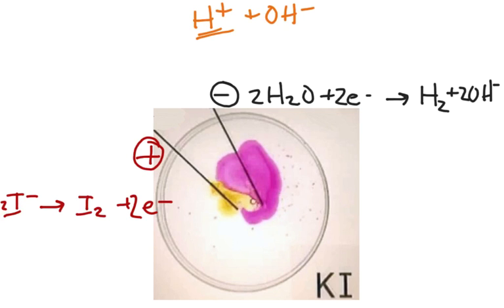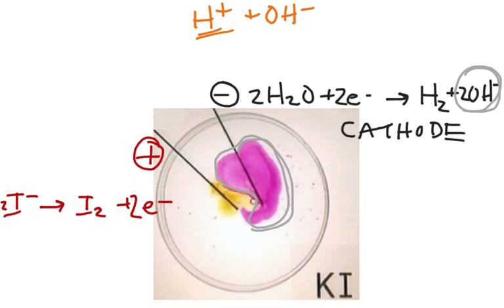So at this negative electrode, which is our cathode because reduction is occurring here, we can see what's happening is we're going to get some hydroxide ions. And those hydroxide ions, with a little phenolphthalein, is what makes all this pink color. Now you can also see there's a little bubble there, a little bubble of hydrogen gas as well. We can see we're getting hydrogen gas and we're getting hydroxide ions by the pink color.